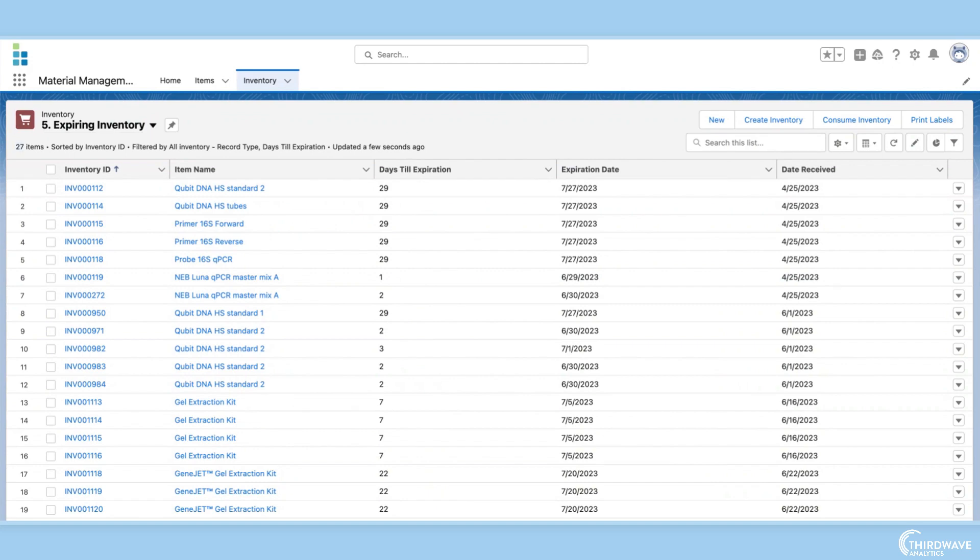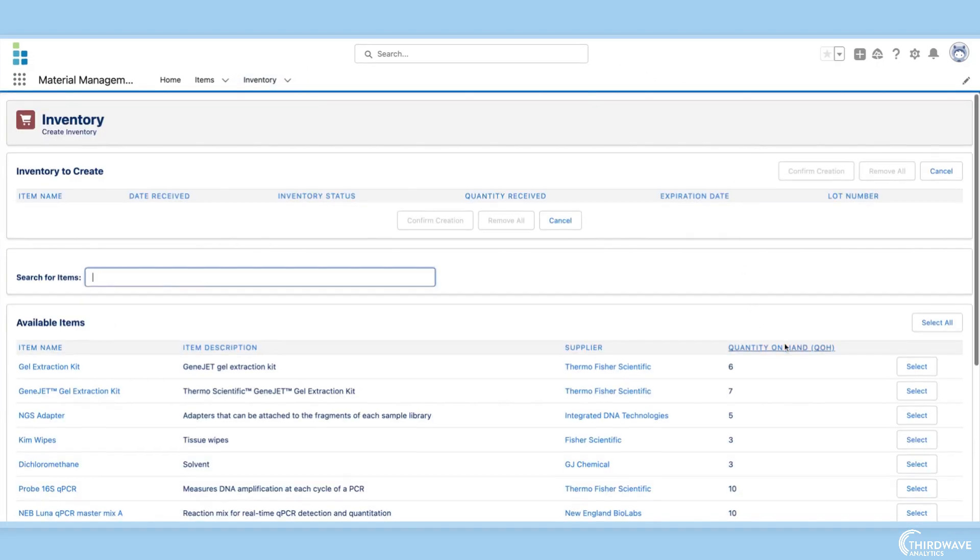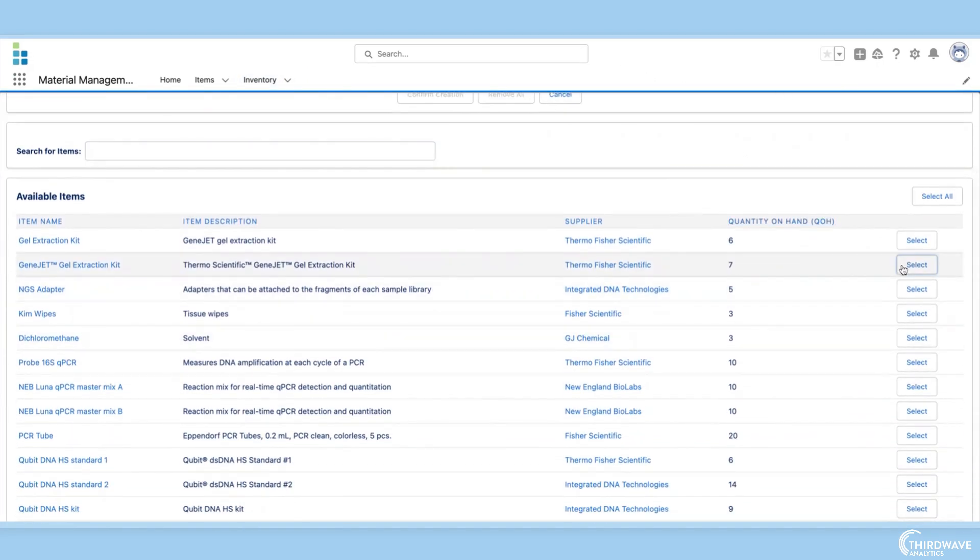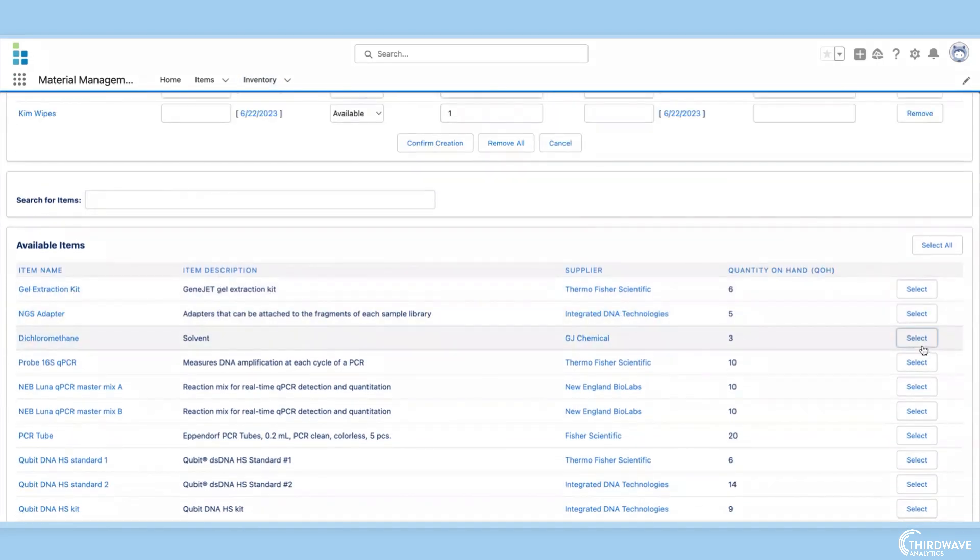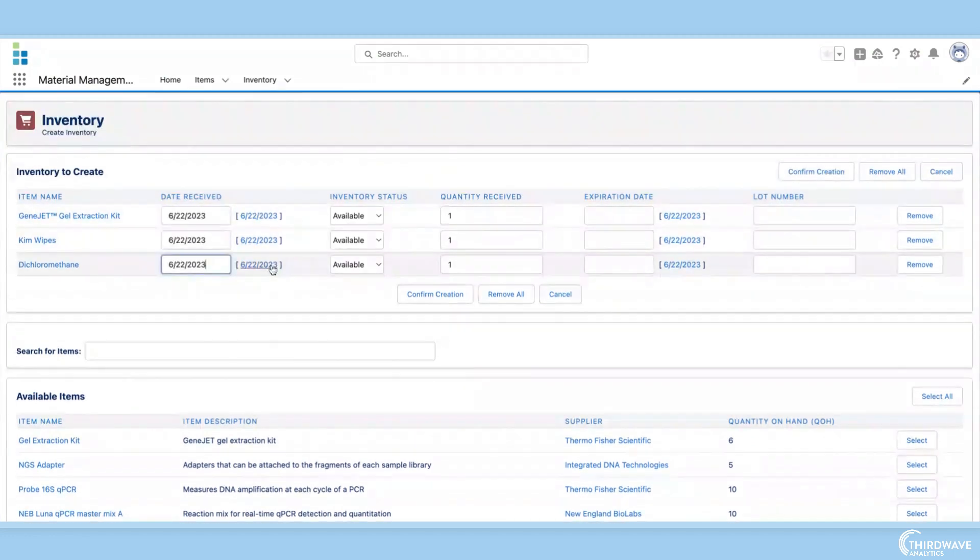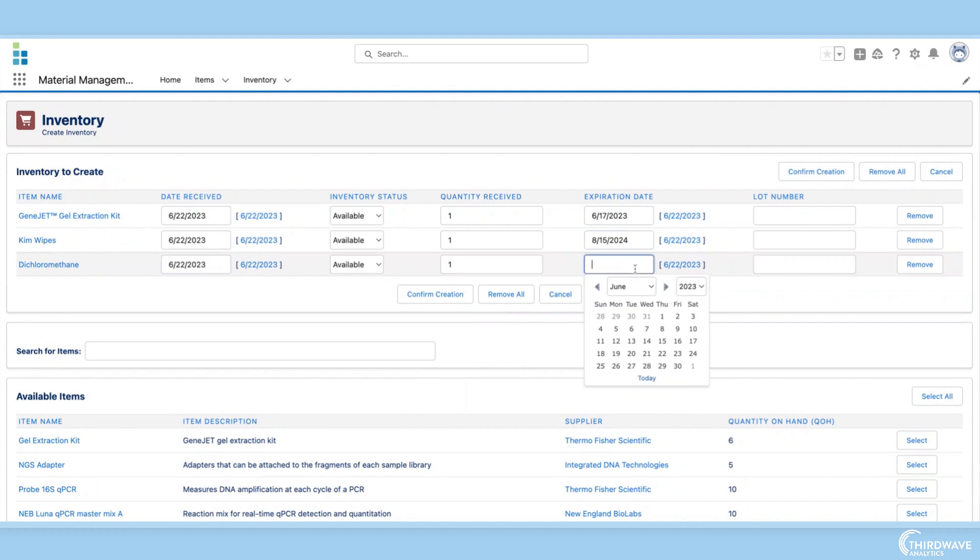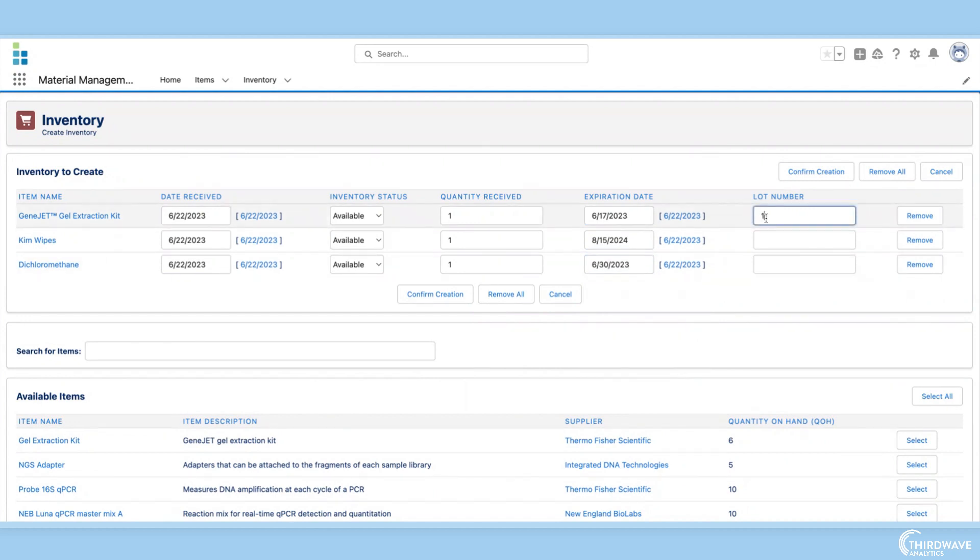If a new shipment has just arrived in the lab, we can create multiple new inventory records by clicking Create Inventory. Here we can select the items we are adding to the inventory, mark the day they were received, the quantity received, their expiration date, and lot number.